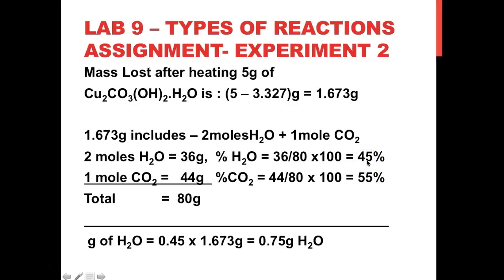So 45% of 1.673 grams would be 0.75 grams of water. Okay, so the grams of water that left the hydrate would be 0.75 grams of water.